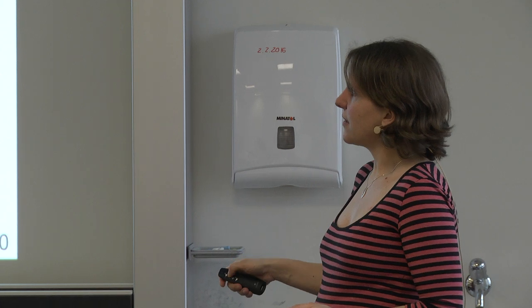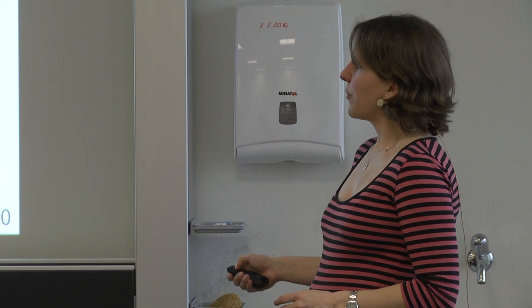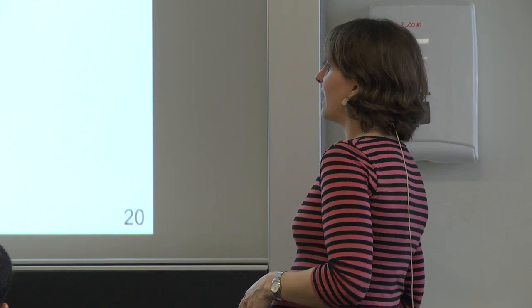With Q-concats, as you can put up to 50 peptides on one plasmid, maybe you can increase this number a bit. And with protein standards, people usually really just work with their protein of interest and just have very few proteins of interest for which they then go through this tedious work of generating an isotope-labeled protein standard.